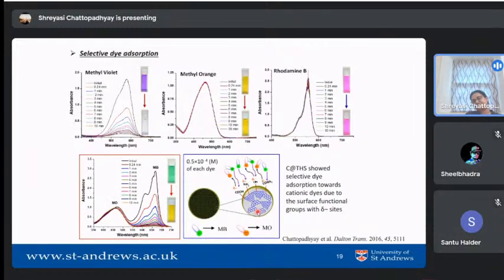Now, I thought to put another example, although this is not related to green hydrogen production, because it might be interesting to some of you who are maybe doing functional group testing in organic chemistry. What we did here is we made nanomaterials which have these functional groups. How do we determine these functional groups? We did XPS, which might not be familiar to you, and also IR, of course, to understand what functional groups are here. IR is the first one to identify the functional groups.